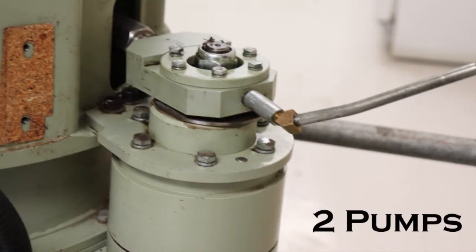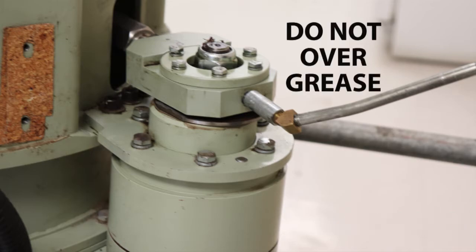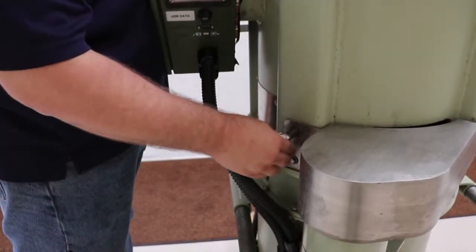Grease these areas with two pumps of grease. Do not over grease this area. Replace the front and rear actuator arm covers.